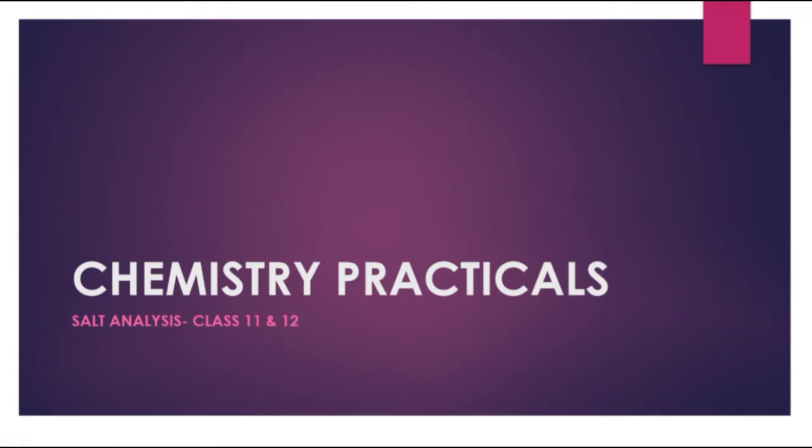In today's video we're going to talk about salt analysis, which is a part of your chemistry practicals for grades 11 and 12. So this is going to benefit both the classes, which is first and second PUC.